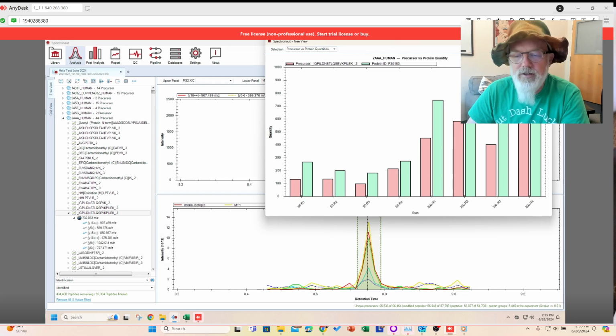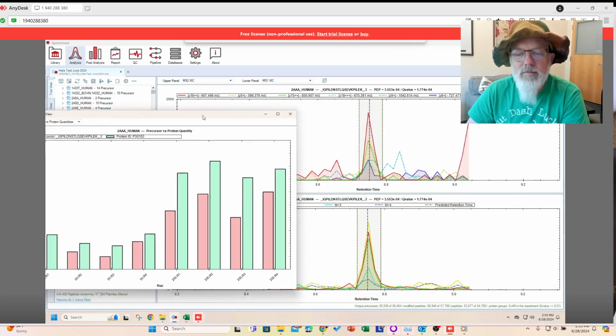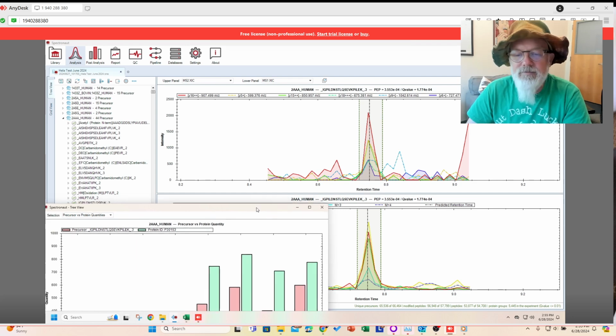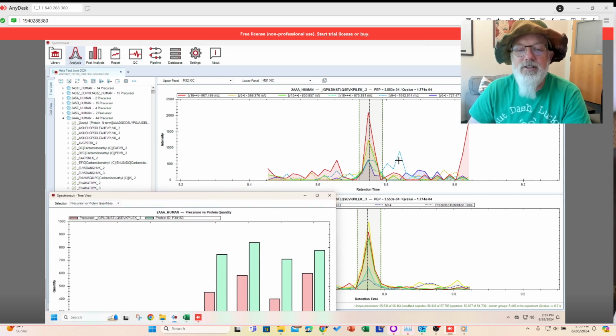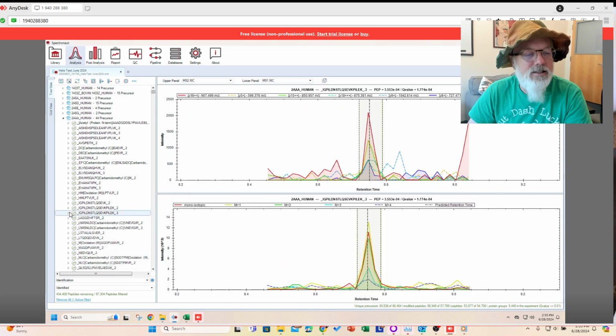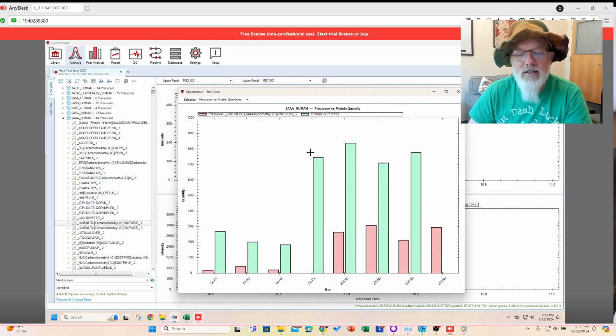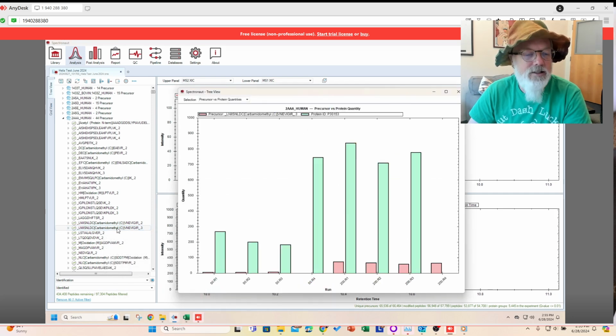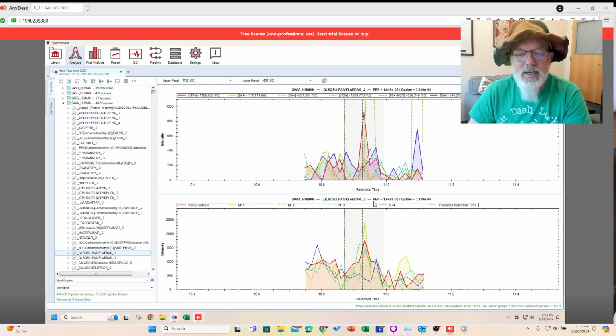Okay, so again you can see here this blue, how it's dashed. That means it's been interference corrected out. The algorithm does not think it's very good because it has a signal outside the area that it's using. So that's good. This kind of looks like you would expect. Here's another one. You can see lower in the 50s, higher in the 200s, just what we expect. Same here. That's good.